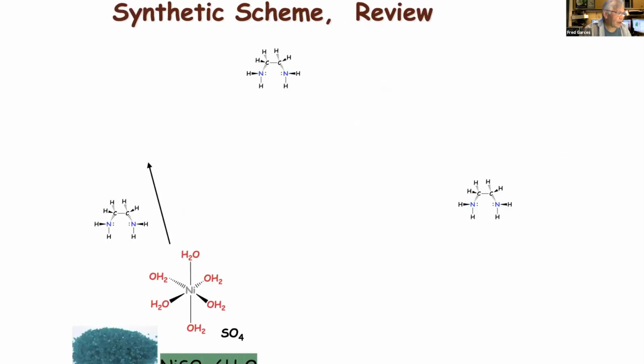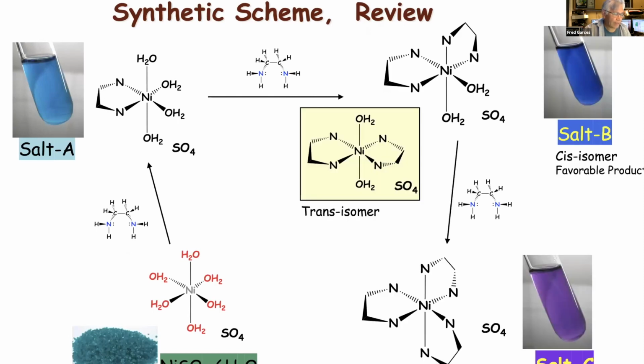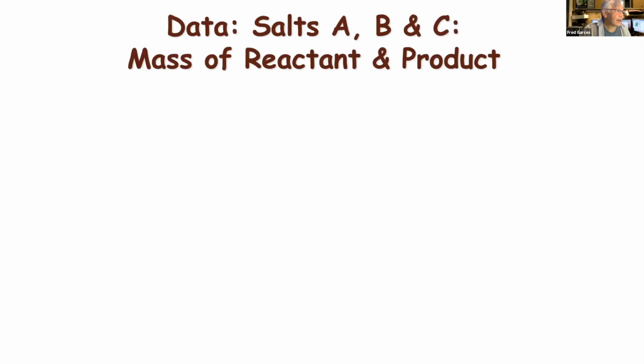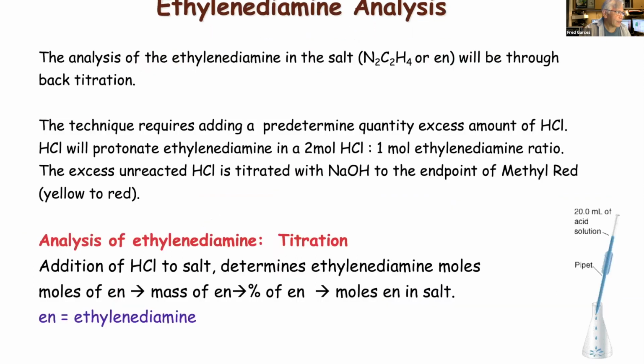So again, I remind you about the synthesis and the different salts, A, B, and C. I remind you about the different formulas, X equals 1, X equals 2, X equals 3. All right. Then I remind you of the data. The first part of this is actually ethylenediamine.